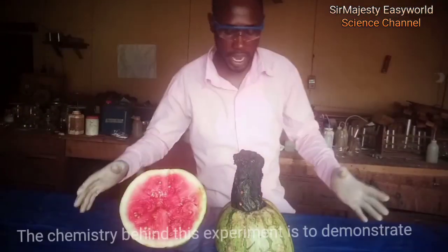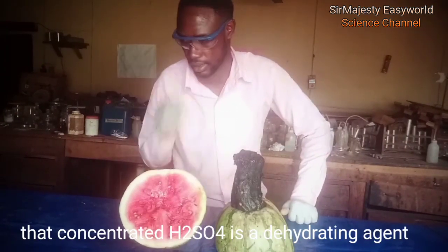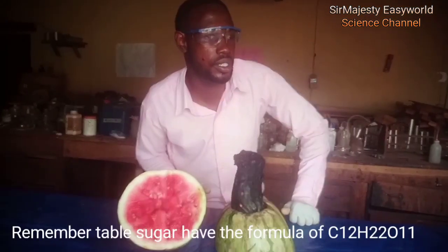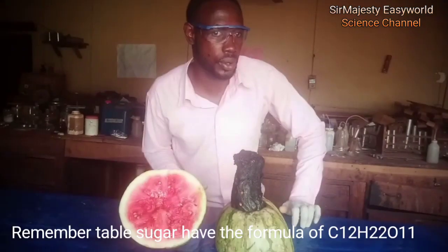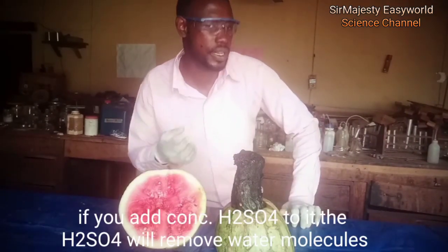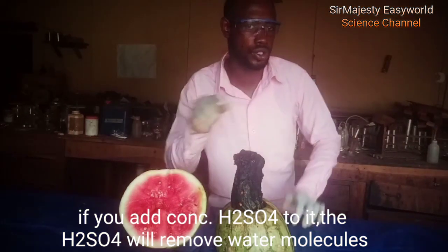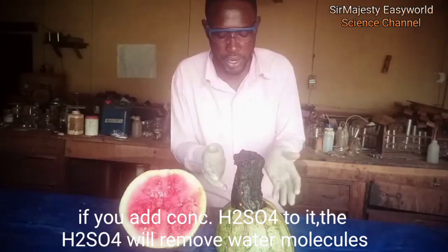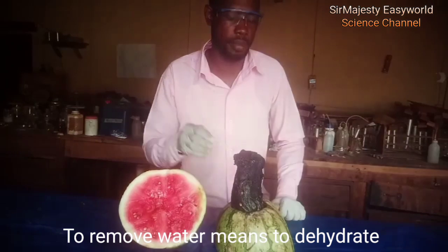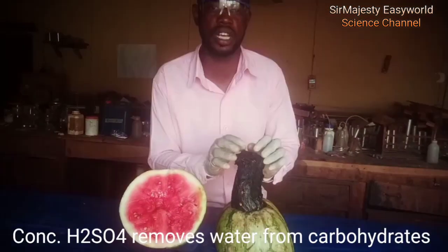The chemistry behind this experiment is to demonstrate that concentrated H₂SO₄ is a dehydrating agent. The organic matter here is the sugar, the table sugar. Remember it has the formula C₁₂H₂₂O₁₁. That is sucrose and is a disaccharide. Therefore, if you add concentrated H₂SO₄, it will remove the H₂O. Remember H₂₂O₁₁ is in the ratio of H₂O just like water. So that is why we call it glucose, sucrose, carbohydrates — because it's just like the form of hydrated carbon. Therefore, the concentrated H₂SO₄ removes the water. This is now charcoal, this is known as sugar charcoal.